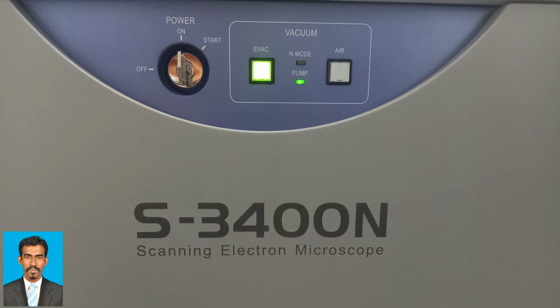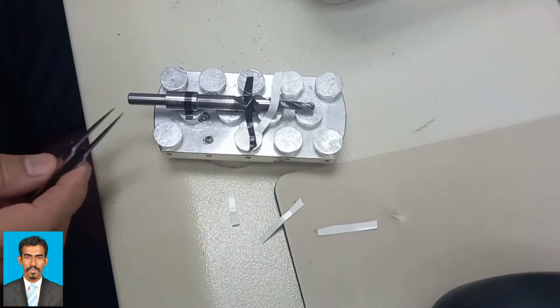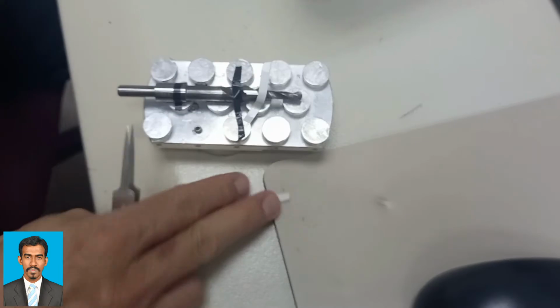To start the program, select All Programs, then select PC SEM from the Start menu on the taskbar. It will open a dialog box, and there you need to enter the login and password details to enter into the software. The next step is mounting a specimen.